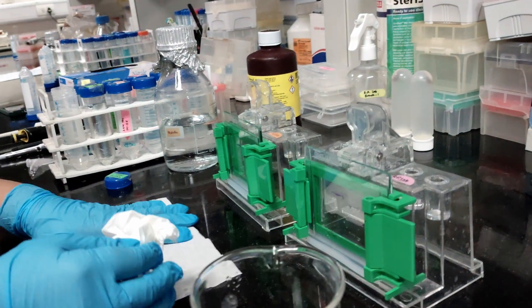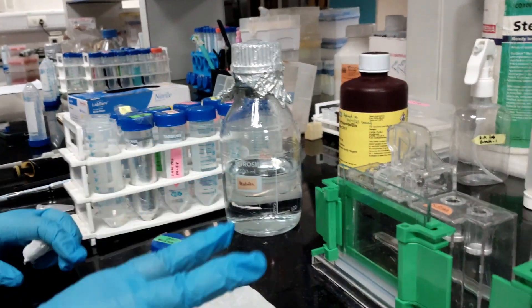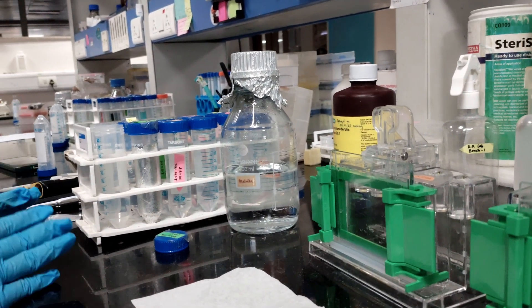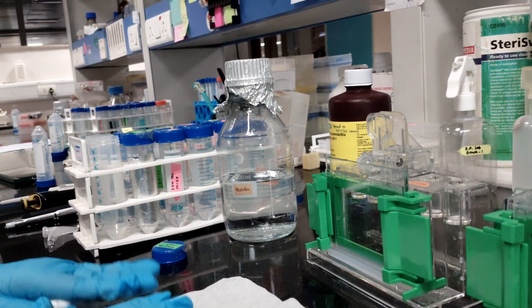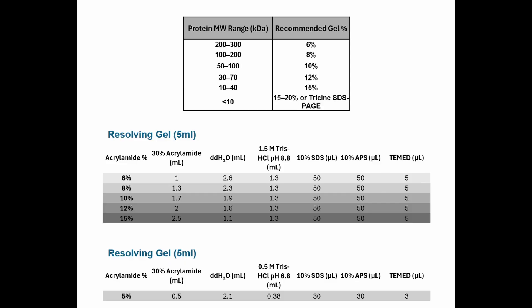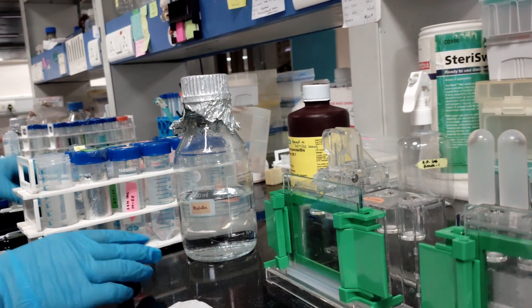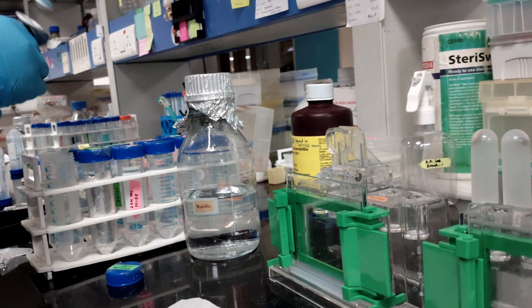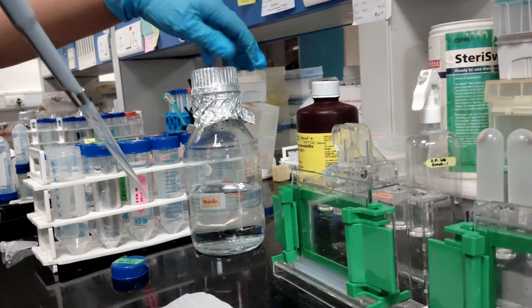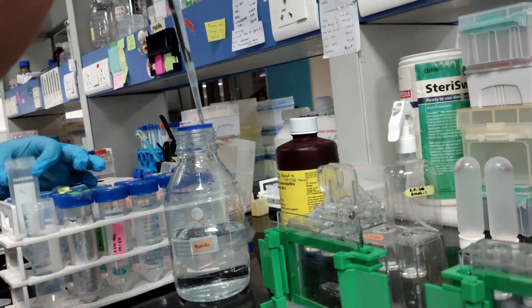Now the plates are set up. We'll now make the resolving gels. Today I am making two 6% resolving gels. The composition of 6%, 10%, and 12% gels varies and depends upon the molecular weight of the protein of interest.